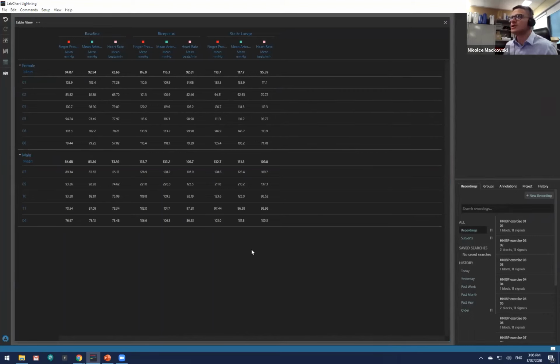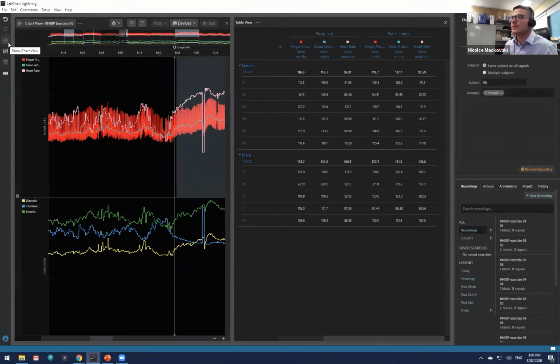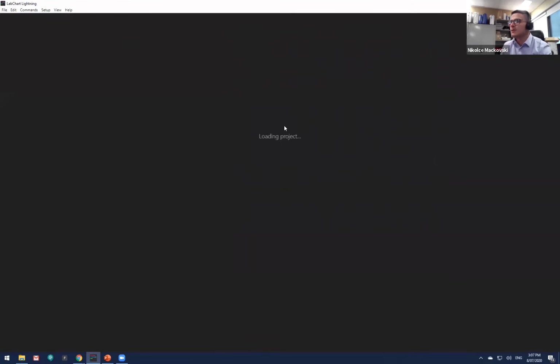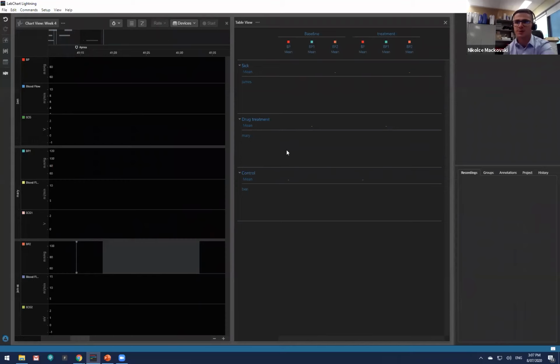So the next thing I wanted to show you was, we went back to here. Now, of course, this is under one subject, so each recording has one subject. But let's just say, you see this option here, it has multiple subjects. So what does that mean? I did cover this briefly within the first webinar. We'll go through that a little bit today. So we go back to File and choose one of my original projects. This is a drug project.